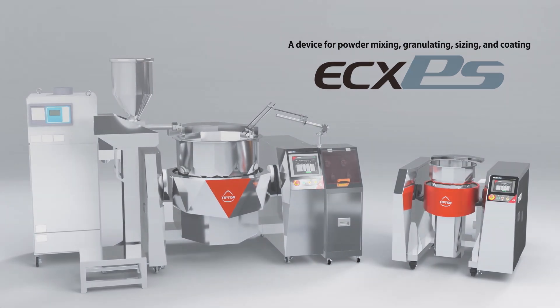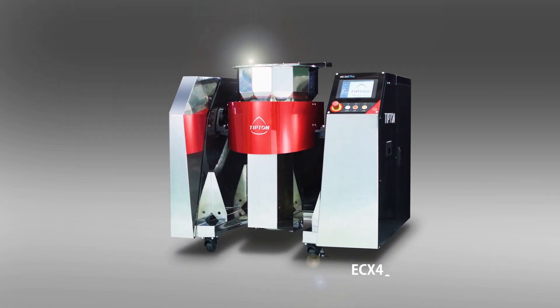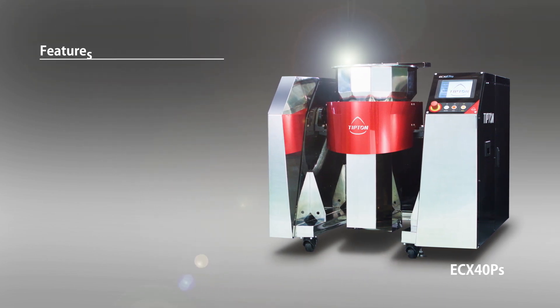With the Vortex Flow made possible by two of Tipton's patented technologies, ECXPs is unrivaled when it comes to its applicability and use cases compared to other similar devices on the market. The device can process pieces of all sizes, hardness, and relative densities.